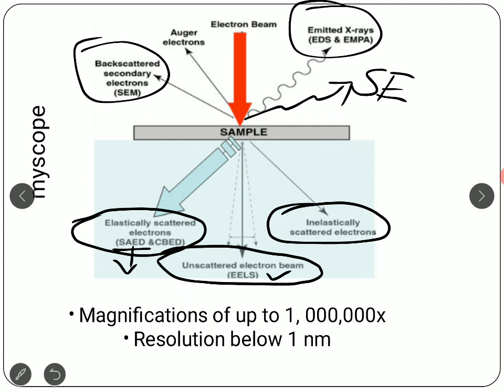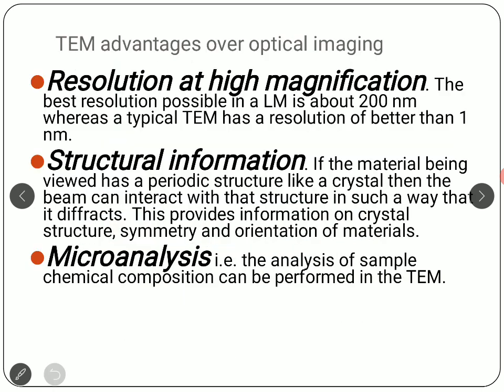The magnification using TEM can be as high as you can see, 10 lakh times, okay, so it's 10 lakh times. And the resolution can be as low as 1 nanometer. It's in fact below 1 nanometer, right? We've talked about a good resolution and a bad resolution, and 1 nanometer can usually be considered a good resolution, okay. So you can observe the difference. If we consider atoms, they are placed very close to each other, maybe even within a region of less than 1 nanometer, and that can actually be resolved using transmission electron microscopy.